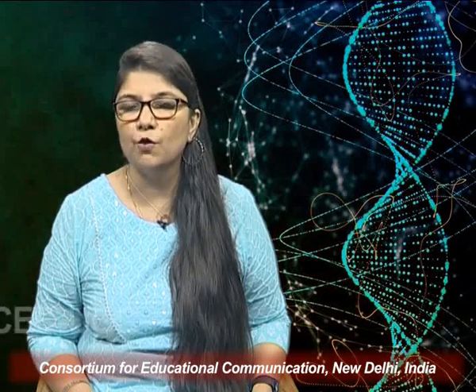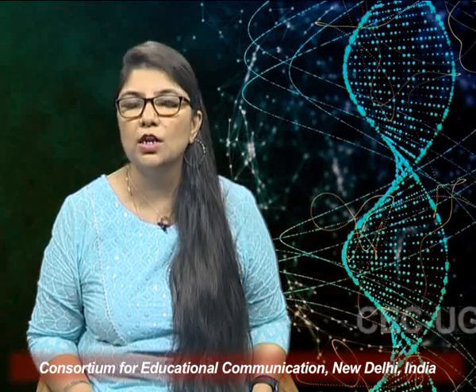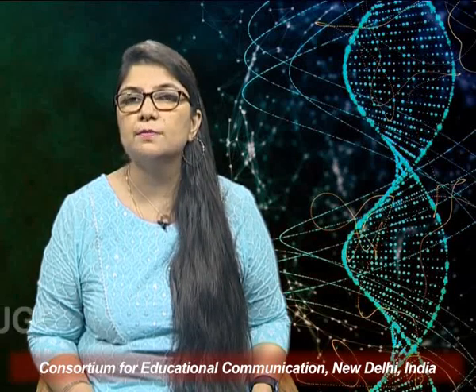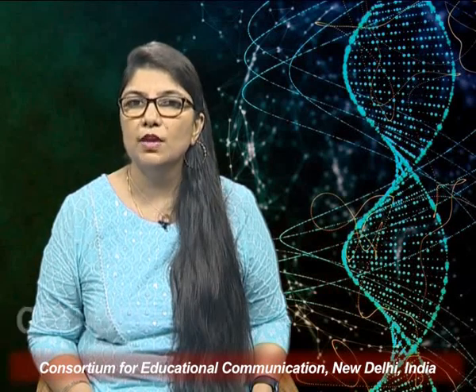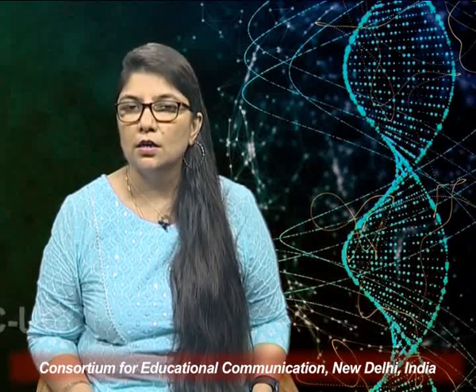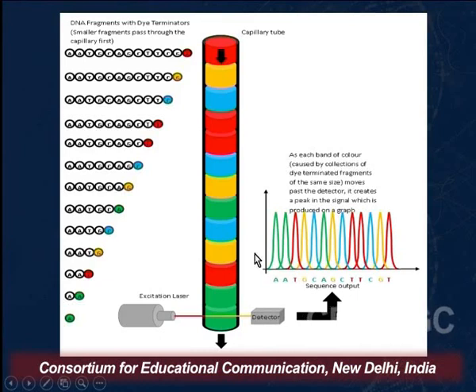In the next session, we'll talk about the next generation sequencing platforms, the NGS platforms, which are nowadays used, where even from a single molecule one can get the sequence, and how it has become so rapid and cheap. Sanger has a limitation that only 600 to 700 base pairs can be sequenced. Now our whole genomes are in megabases. If we are sequencing 600, 700 base pairs in one reaction, obviously it will take a lot of time and cost a lot of chemicals. So, to cut down the cost, newer platforms have been rising.